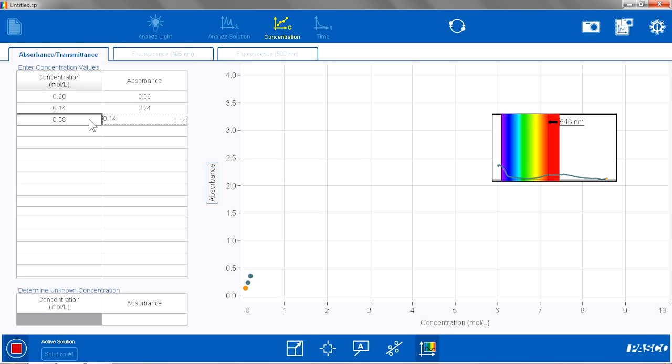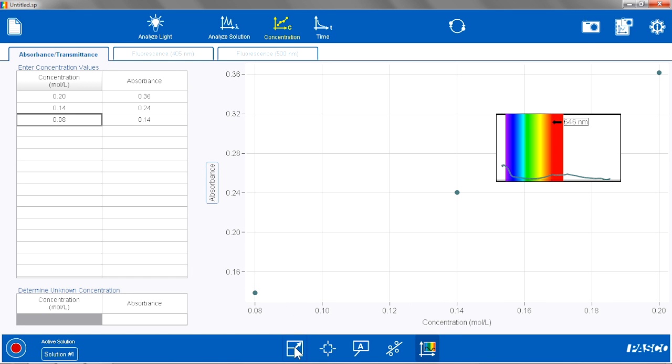I am only doing three standards this time, so I just have those three. Now that I am set, I will hit Stop. I can see my points down here. I can autoscale that graph and see those points line up.